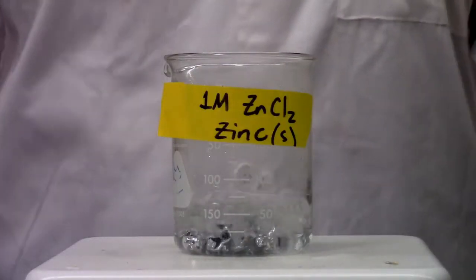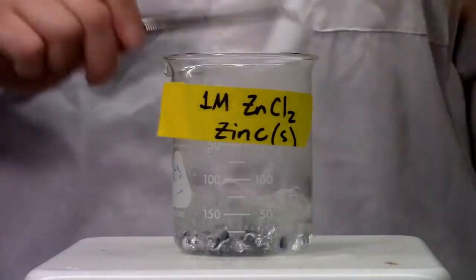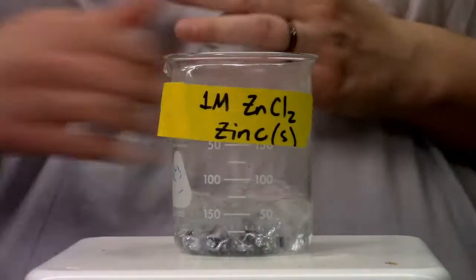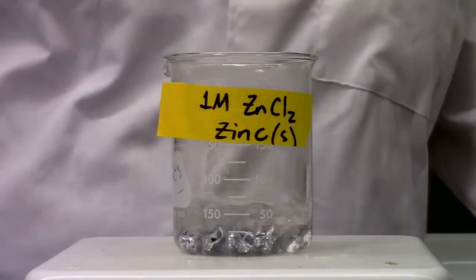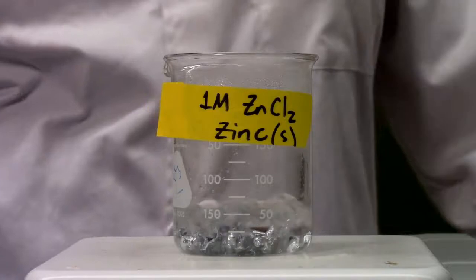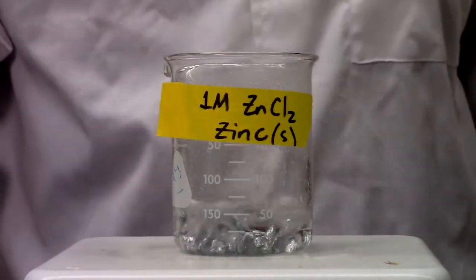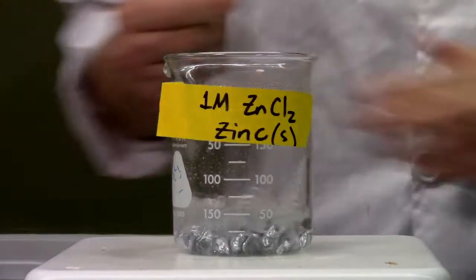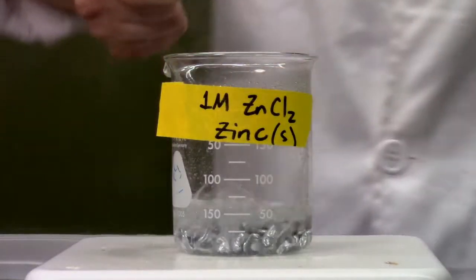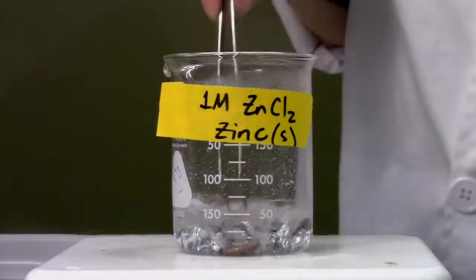Perfect. Our solution is boiling, and now I can add my pennies to the top of that solid layer of metal. There we go. And then do that for another penny. I dropped my penny, 1 second. Woo, that penny rolled, and I had to go chase it. All right, let's put this one up towards the front so y'all can see it a little better.